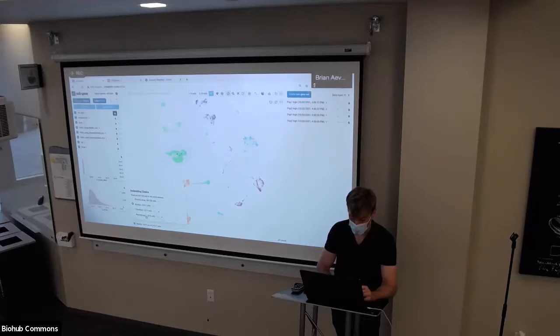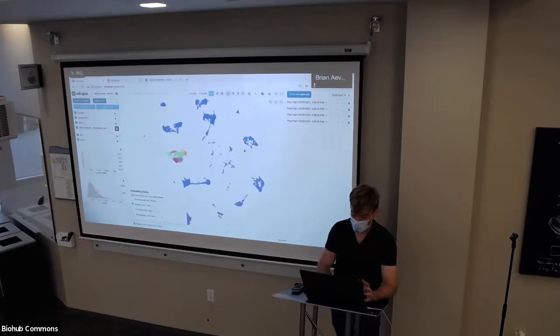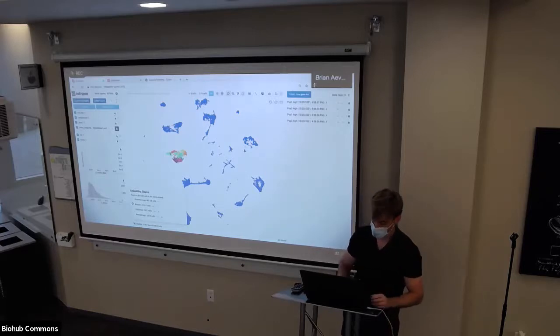I click it, and now it shows me this. And let's say, first of all, I'm just going to delete these. There's a delete labels button. And then what I'm going to do is I'm going to do leiden clustering. And now I have clustering with even greater resolution. And then I can go up here and see back to the bladder view and I can see, okay, I've been able to cluster with a great degree of resolution.